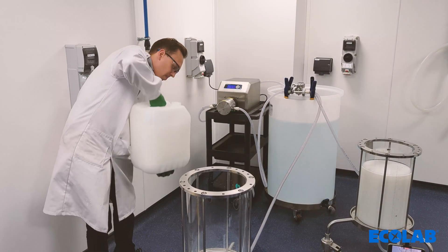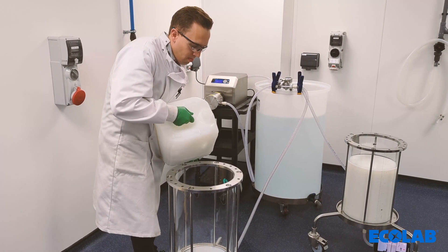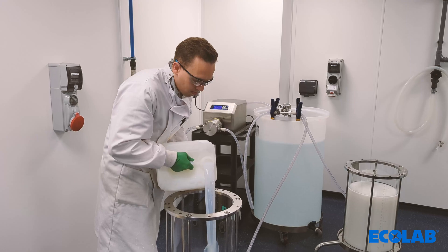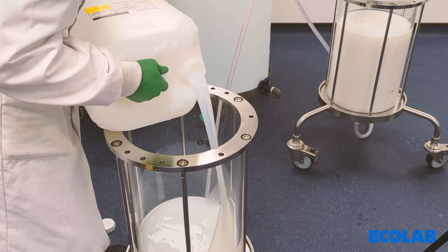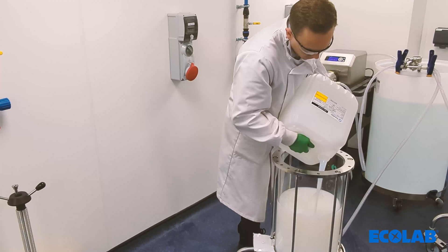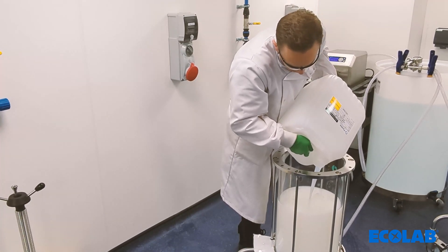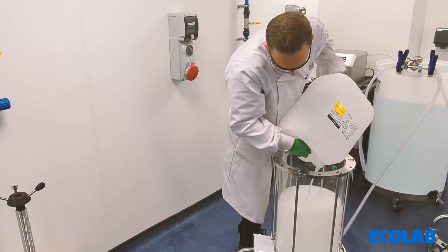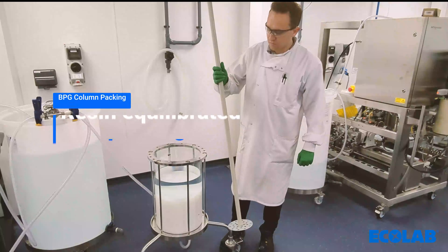The calculated volume of resin can then be added to the column and, if needed, top up the liquid level to 40 centimetres using the packing buffer. Perform a buffer exchange from the storage solution into the packing buffer by either washing the column with a low flow or decanting the liquid level after settling the resin. Once the resin is in the packing buffer, the resin needs to be mixed to a homogenous slurry.